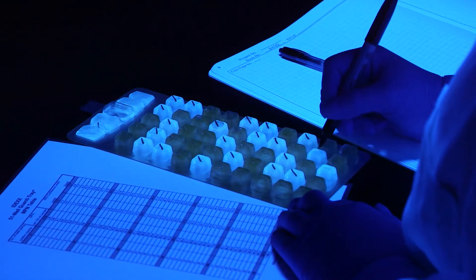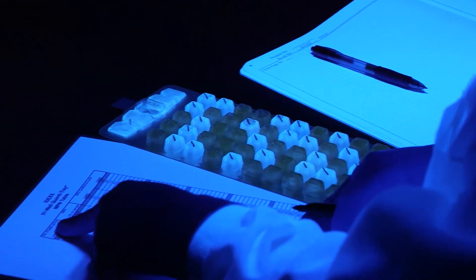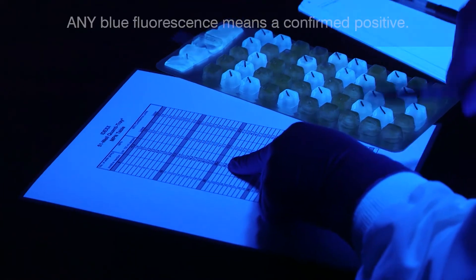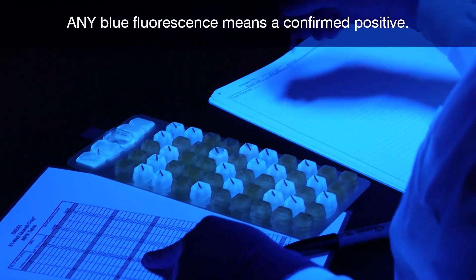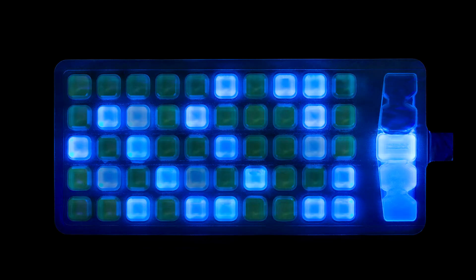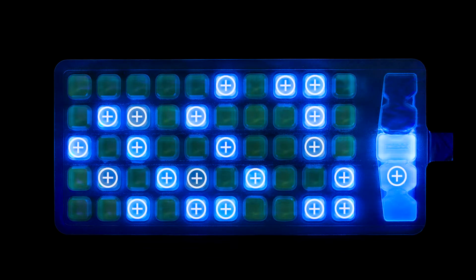The most probable number for this example is 28.8 per 100 milliliters. If using Quantitray 2000, count the overflow well as a large well. Any blue fluorescence means a confirmed positive for enterococci. Here is an example with both strong and weak fluorescence. There are a total of 22 fluorescent wells.